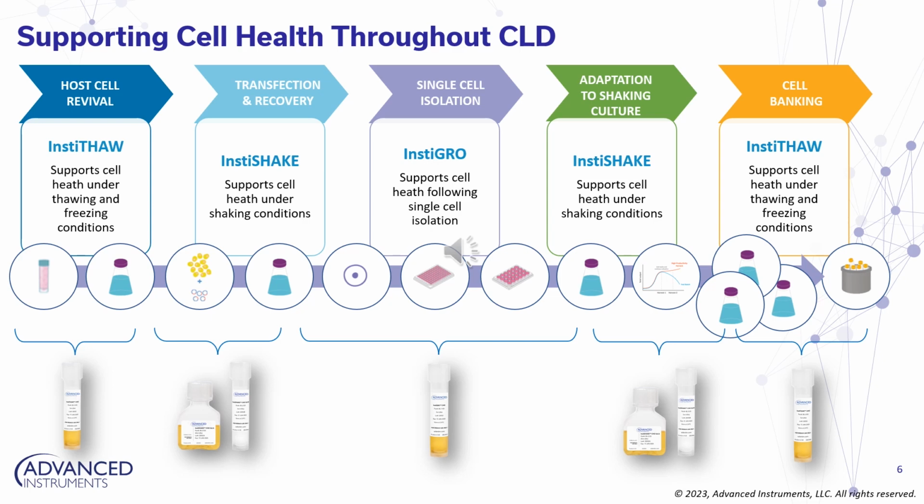It is often the transition from static to shaking which causes cell stress, resulting in viability and cell numbers dramatically reducing.